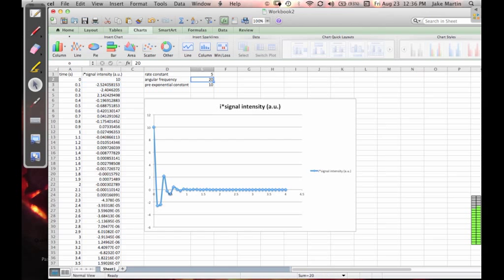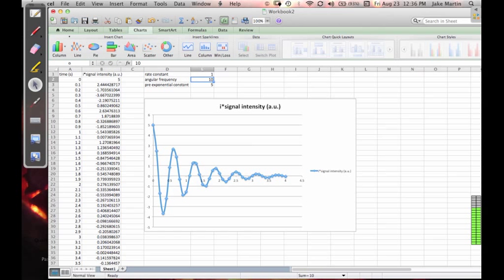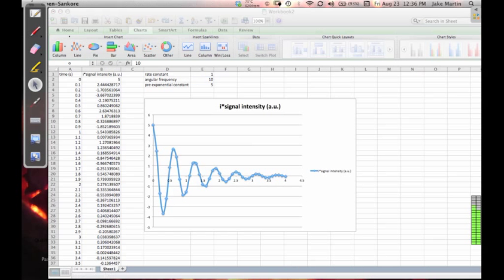Let's go to a prettier value. Make this small. That will look nice. Okay, well, that's all I have to say on this subject.